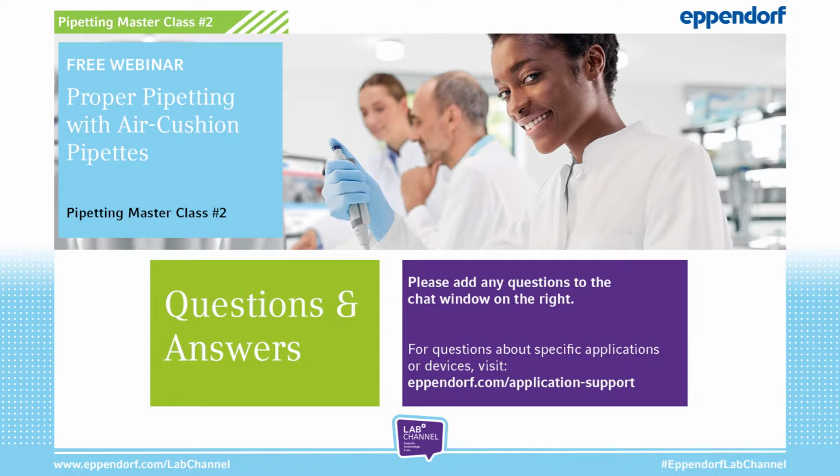You can also consider a positive displacement system, because here the sample is hermetically sealed and you are not dealing with any kind of aerosols within the system. But here the tips are relatively expensive, so maybe it's not the best option for you because of the throughput that is required in cell culture. And as I said, there are different types of contamination and also causes for it in cell culture.